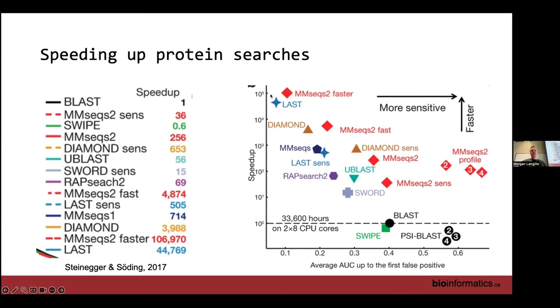The carbohydrate metabolizing genes, CAZy, is quite of interest, especially for people studying things like milk metabolism or just any other types of carbohydrate metabolism, like, you know, you're really into carbon. And so the resolution of distinguishing essentially different types of carbohydrate metabolism genes is much greater here than you would get from UniRef.